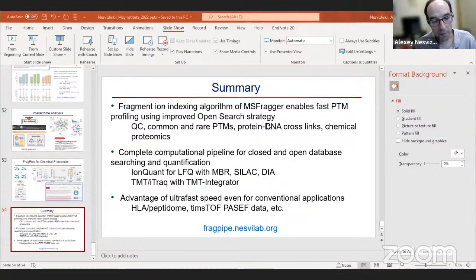Maybe Fengchao can show you that. If you run PTMProphet, IonQuant will look at the localization probability of 0.75 for deciding which sites are localized, and will generate the reports. If it's a TMT workflow, and PTMProphet is used for localization, TMT-Integrator will use that, and you'll have these reports. If it's SILAC, we have SILAC as well. IonQuant does SILAC and regenerates the reports.